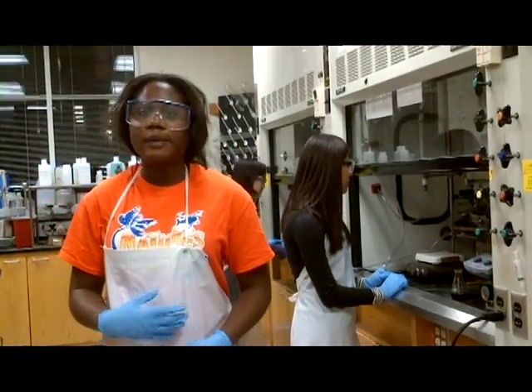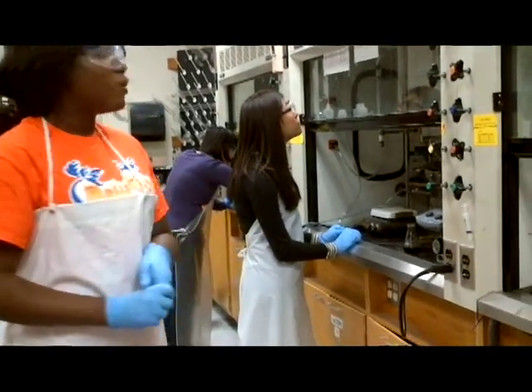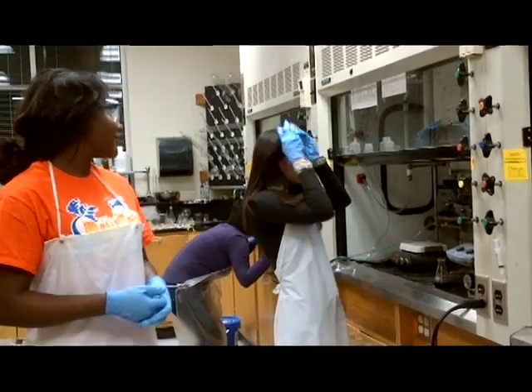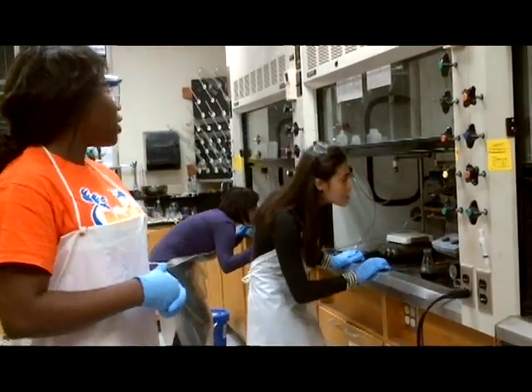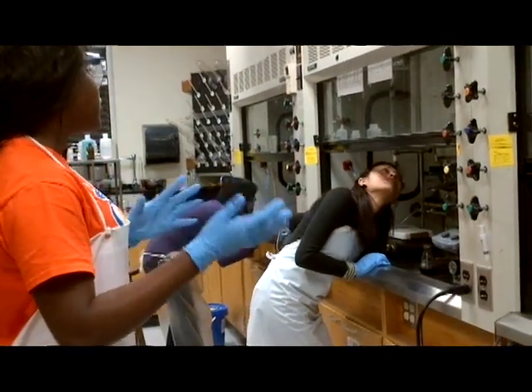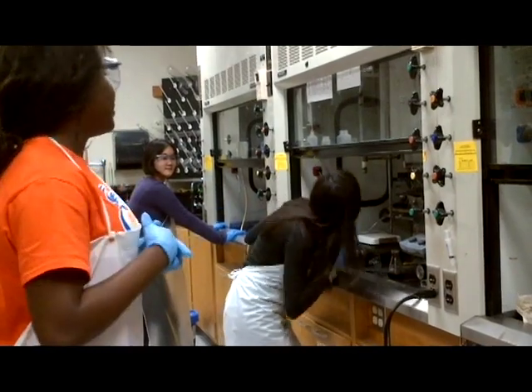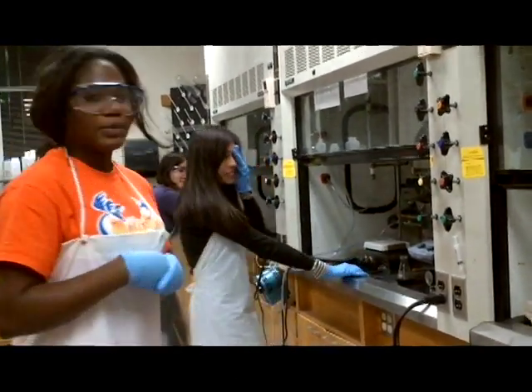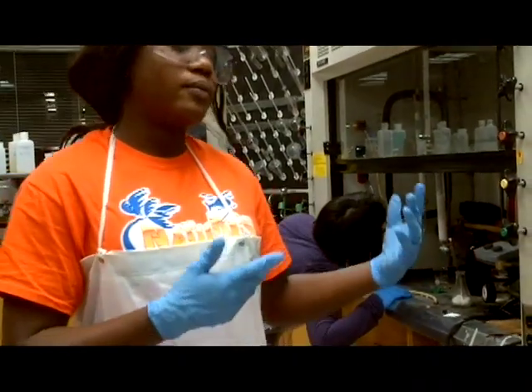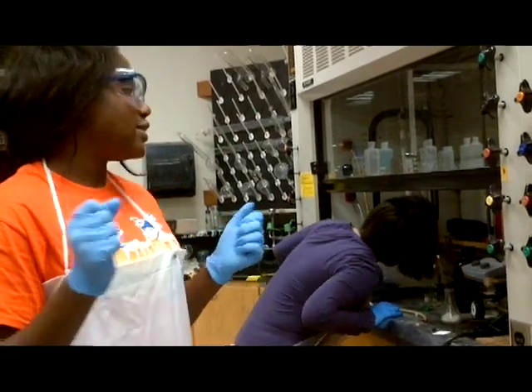As part of lab safety, all work needs to be done under a hood, and all lab equipment should still be worn, including goggles. Also be very careful with items in the hood, and be very careful with your head, and just not to hit or injure yourself.